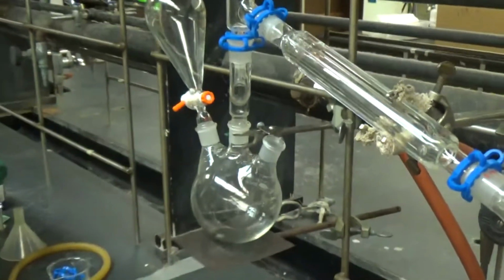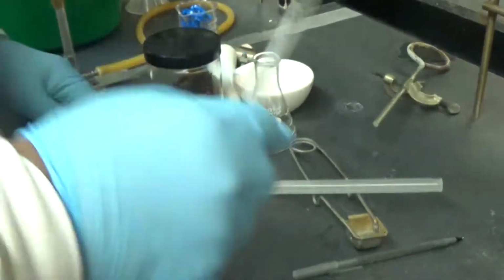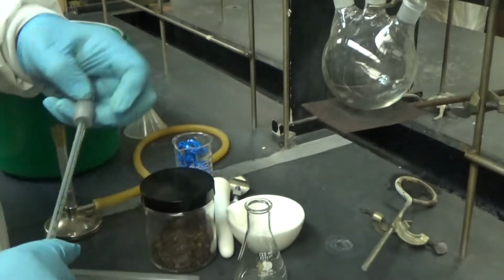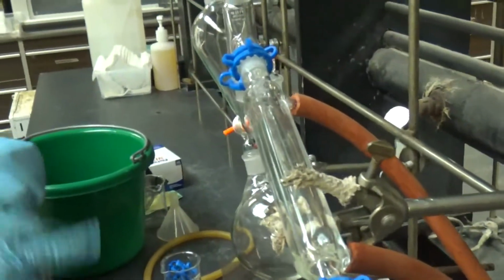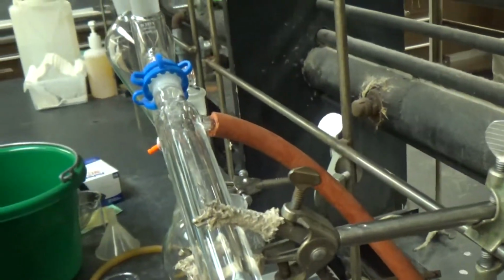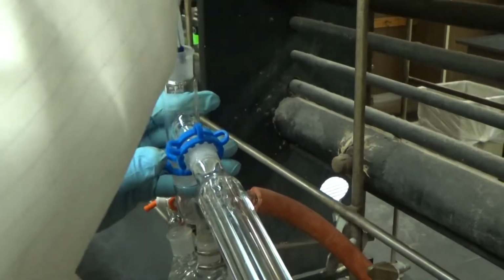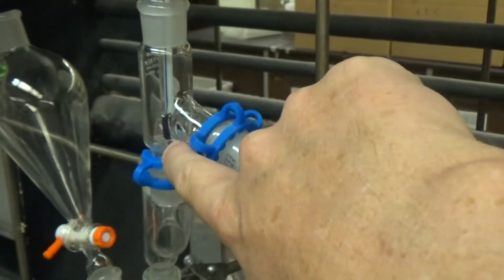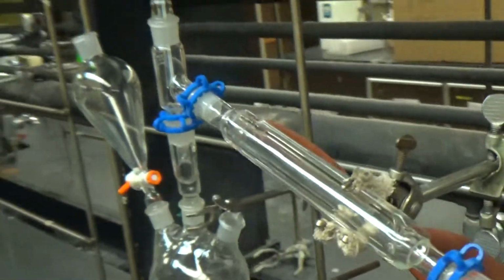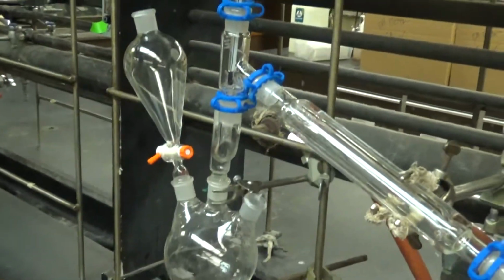Now here is a thermometer adapter, like you used last week. Thermometer adapter and the thermometer. And that's going to go up top in the middle, just the right distance so that the blue part of the thermometer is right there. So the thermometer reading is where the vapors are going to climb up and then condense through the condenser. Flip it down for security. Alright, so that's the full apparatus.